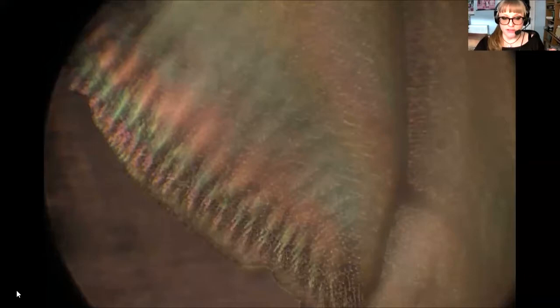First of all, I'm going to tell you about why we do that. Basically when you have a microscope and you put anything under there, the depth of field is really shallow, so that means there's only ever a tiny part of that picture that's in focus at any one time. I just share this series of pictures to show you. These pictures were all taken manually. I just moved the focus and took a picture each time.